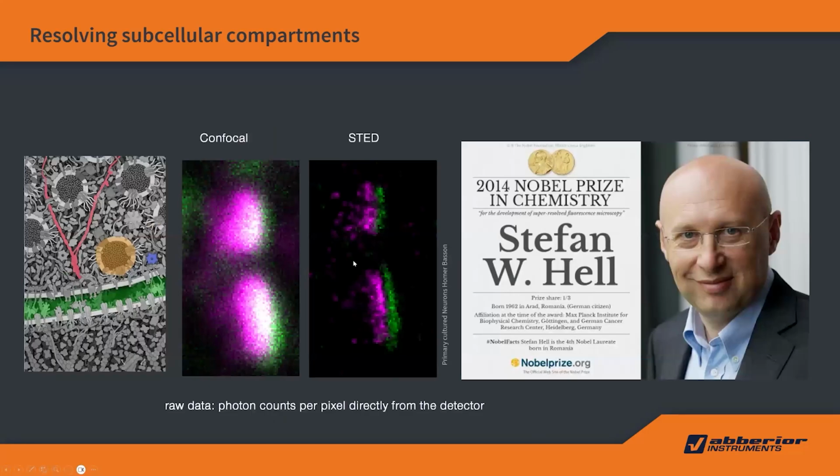The resolution improvement has a dramatic impact on the authenticity of scientific data and on research quality, as you can see here. From the confocal, it's misleading data, right? You see colocalization, you might think there's a translocation of the proteins, while instead it is so clear the pre and the post synaptic compartments are apart from each other. So actually there's no interaction of these two proteins being imaged. And that's the power of super resolution optical microscopy.